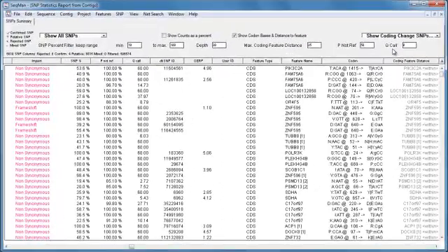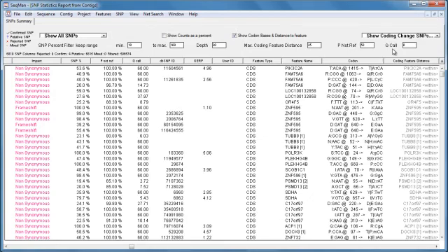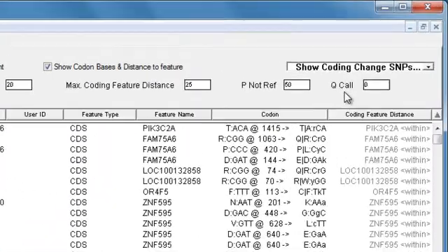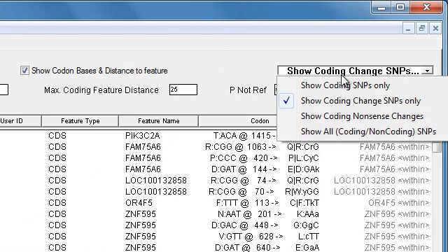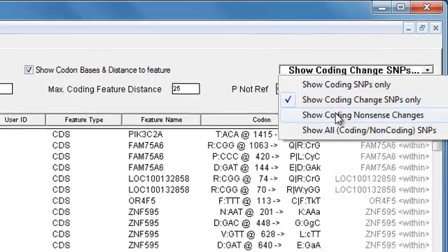And now, everything in the impact column is magenta. I can use the same dropdown to show only SNPs that result in a nonsense change.